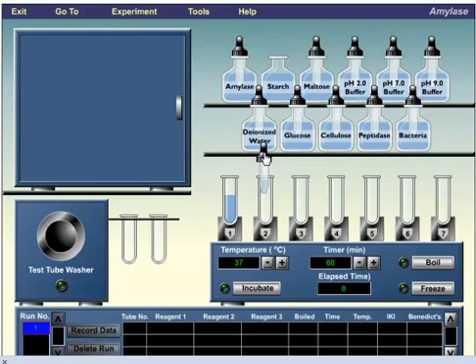In tube number two, suppose we add starch, we add water, and we add a buffer at pH of two.